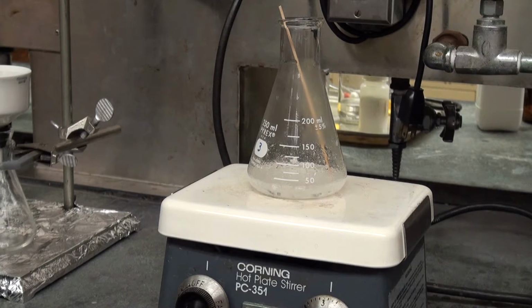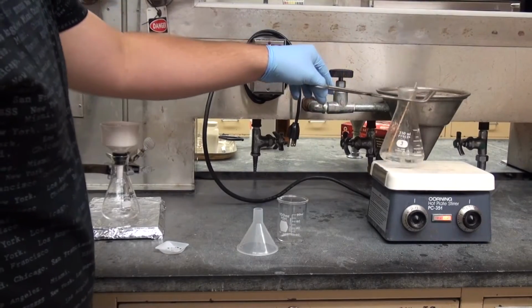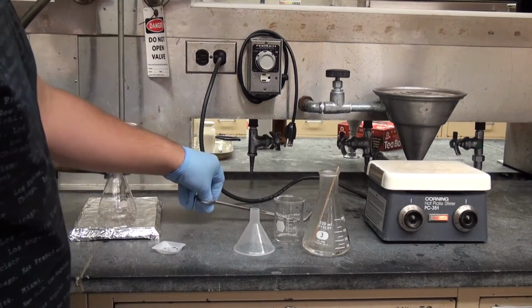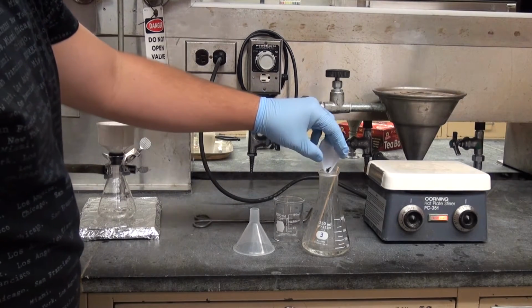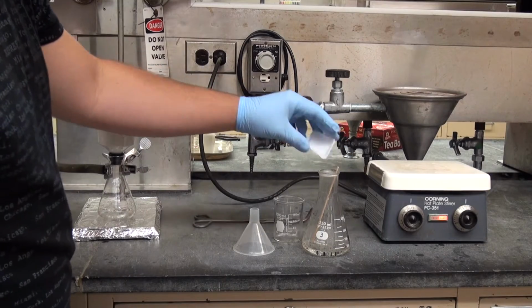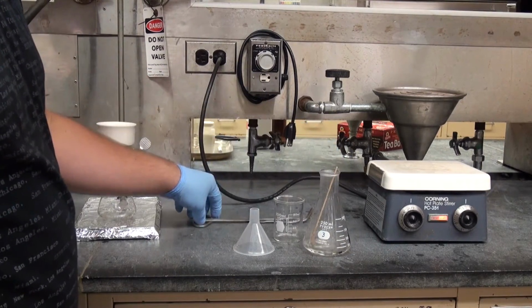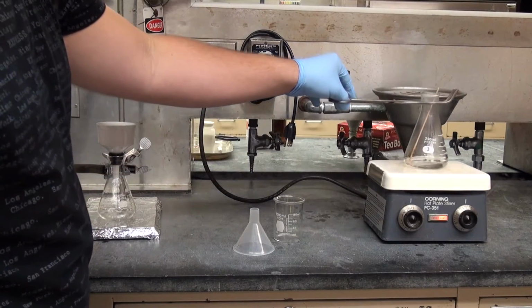If you believe the solution is very concentrated, add more water to prevent benzoic acid from crystallizing in the filter in the upcoming hot filtration. The next step is the decolorization of the solution with activated carbon, also known as Norit. In order to do that, let the solution cool down slightly below the boiling point and add about 5% of the weight of the original solute. Return the flask to the hot plate and resume boiling for approximately 10 to 15 minutes.